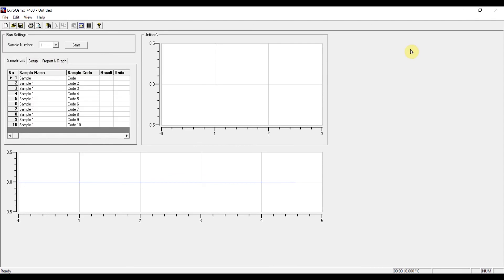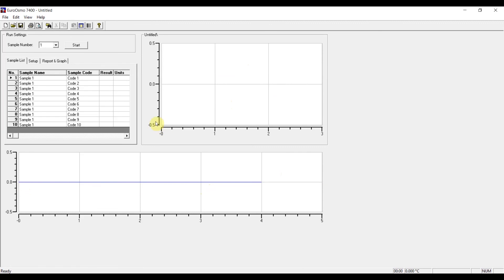Moreover, on this user interface we have also two graphs. Here the bottom one is a live recording of the temperature that is measured by the thermistor or the high precision thermometer in the osmometer. And here in the right upper window we have the temperature curve of each measurement which is recorded after you push start here and until the osmometer signals that the measurement has ended.